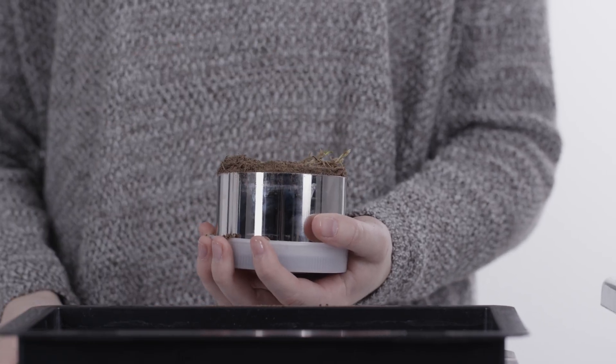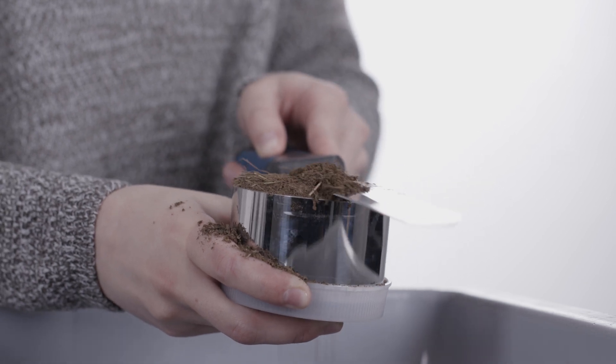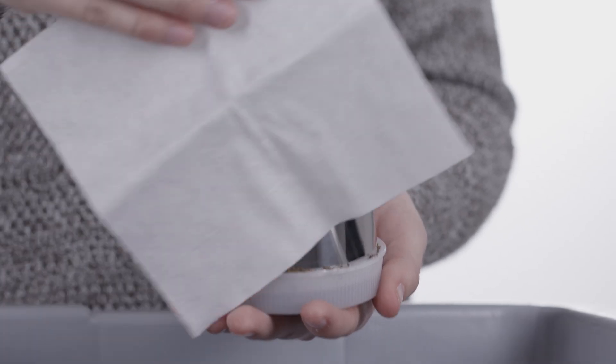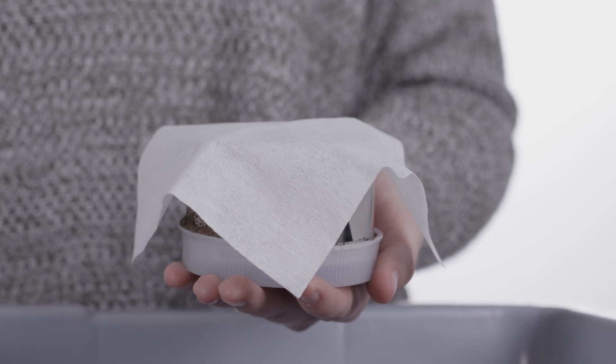Remove the top cap. Prepare the top of the sample with a saw blade or knife, being careful not to smear the soil pores. Place a non-woven cloth on the prepared soil and put the saturation plate on the sample ring.